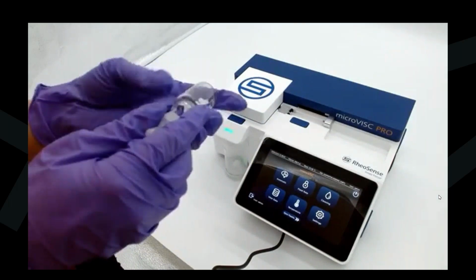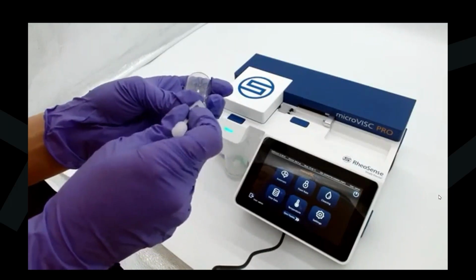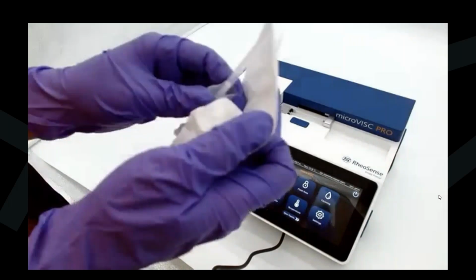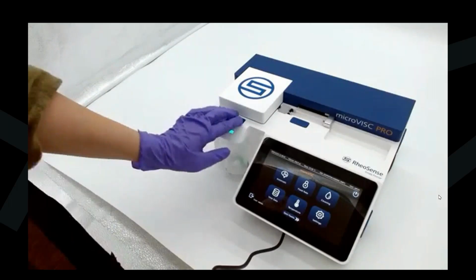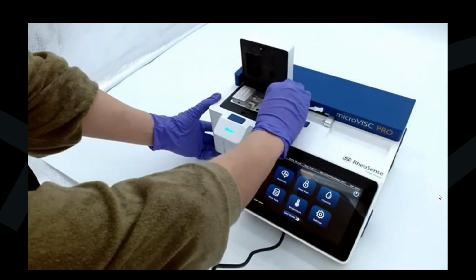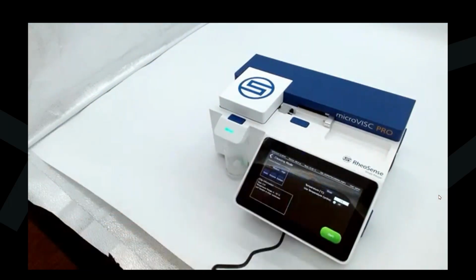So here, Sahila is showing the loading for the sample. So it's very quick. Remove any excess from the outside. And now we're going to remove the previous pipette, introduce this cleaning solvent, and then we're going to go to that cleaning icon.